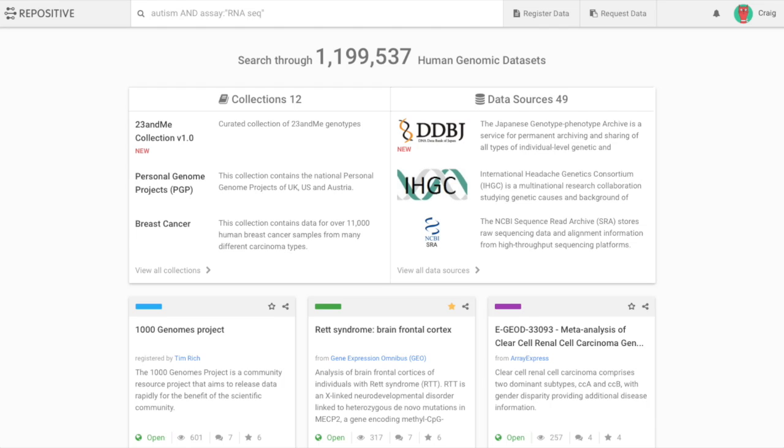Once we have identified, we take all the public data, even restricted access data. The metadata is public because the description is not sensitive to the patient. You can know about the samples and so on. And then we take all that data, we ingest it, structure it, and put it under one single interface.